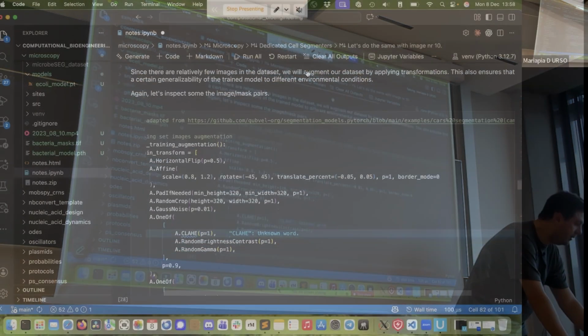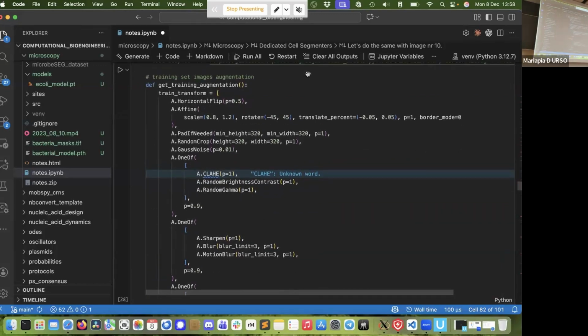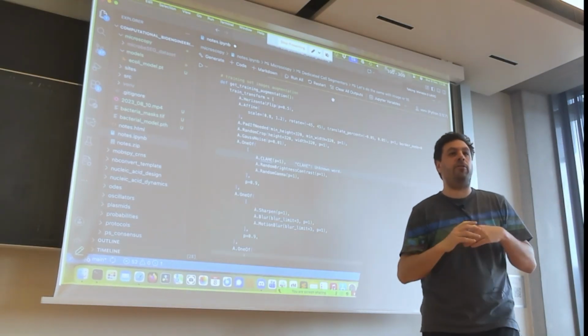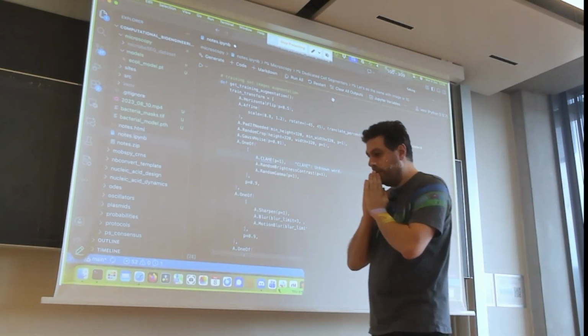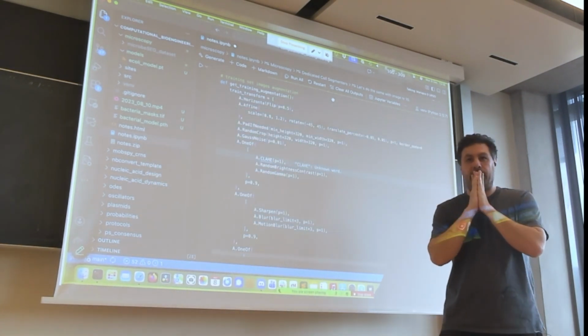This is quite fun because here you have to think about what meaningful augmentations are. What are meaningful things you might want to do to your pictures? This depends a lot on your application. If I take a picture of this classroom, I might use completely different augmentations than I'm using here. For example, one thing I can tell you, we are not using any perspective augmentations. It doesn't make sense.